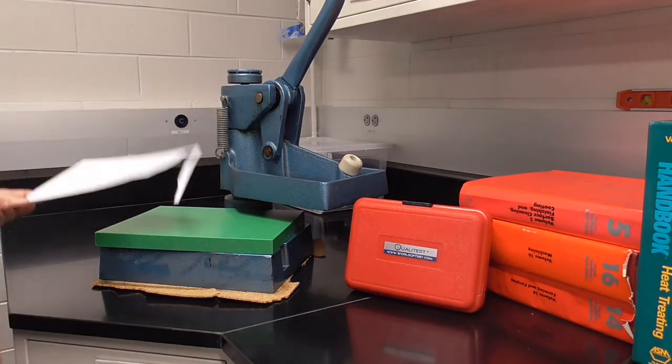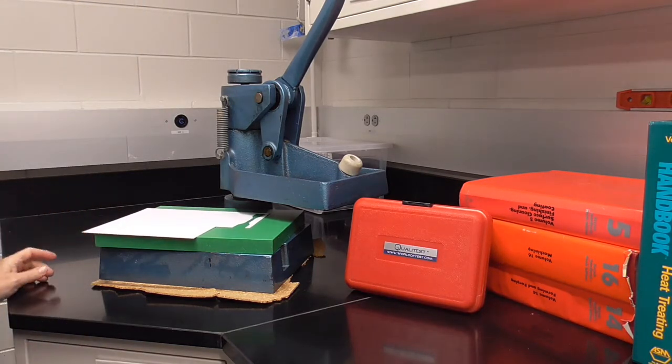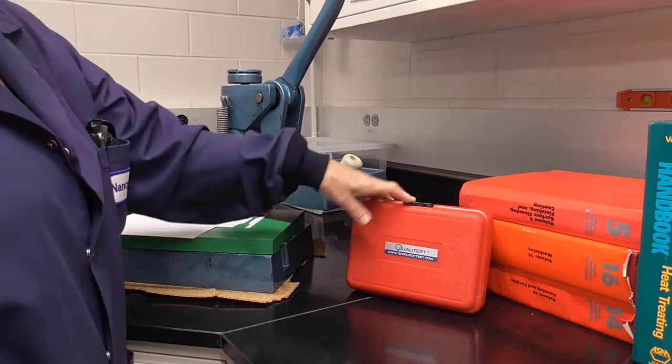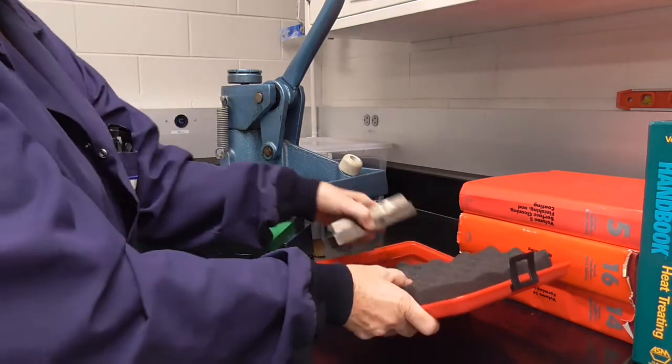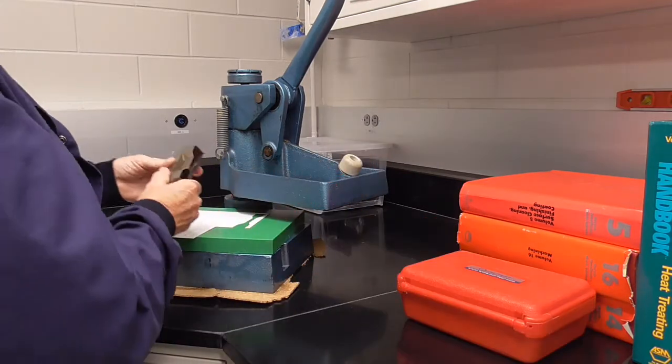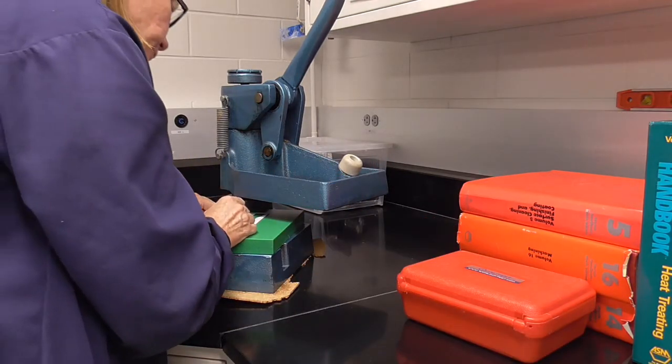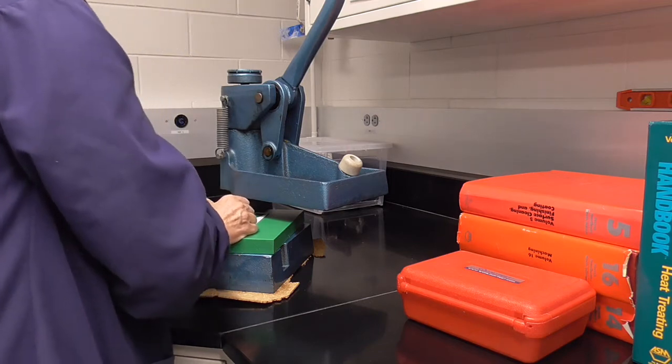Simply take your polymer film and place it on the plate, and here you'll find the die. Place it on the film where you want the dog bone cut.